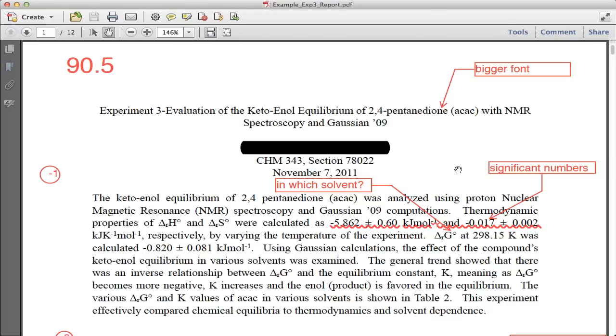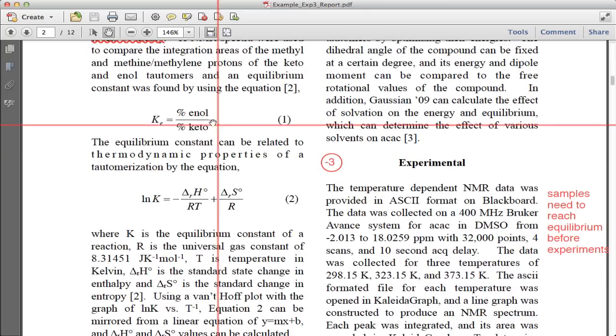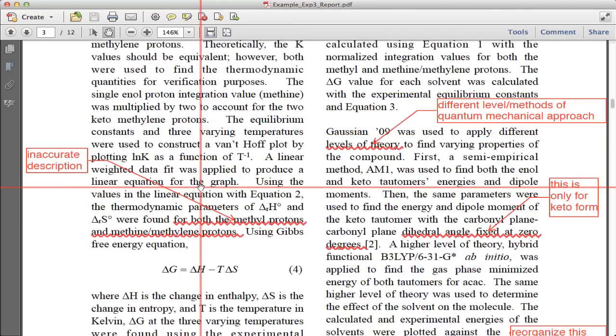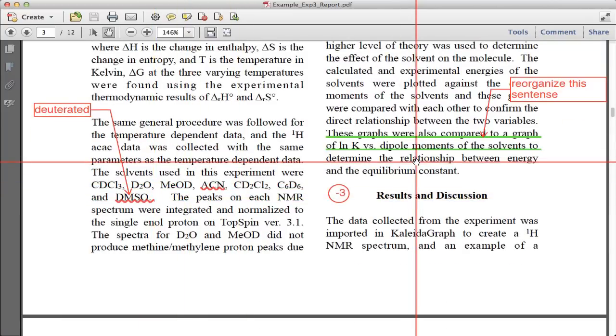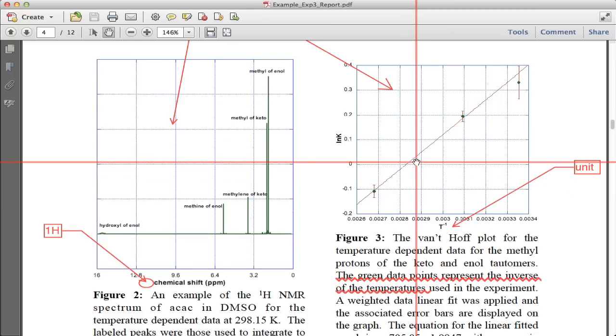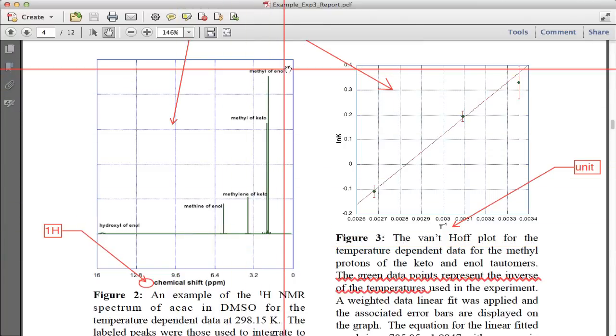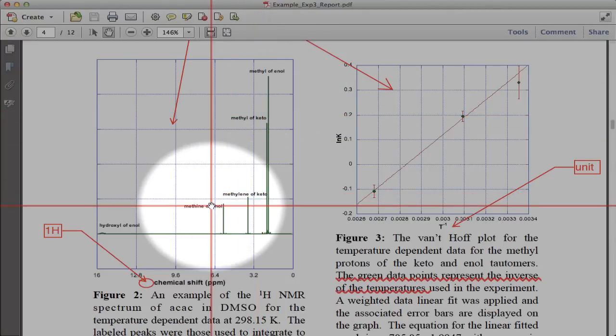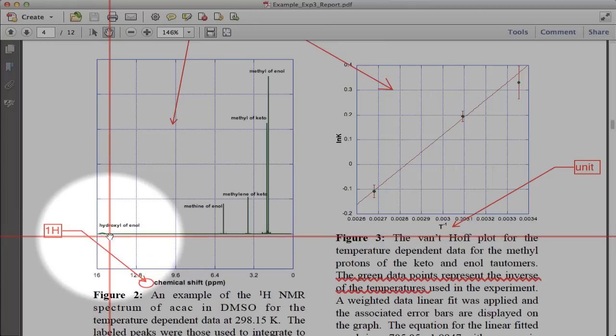I'm not going to bother to go through a lot of details, you can see this one's already graded. What I want to jump down to is of course they introduced the topic, they introduced what the equilibrium they're setting up, how they're going to calculate the thermodynamic parameters, what thermodynamics they're looking at. This person did fairly well, what different solvents they're going to use. Let's start with looking at their graphs so it's the proton chemical shift in PPMs and they show a nice assignment that you can resolve the methyl on the enol from the methyl of the ketone from the methylene of the ketone of the enol and then even the acid proton.